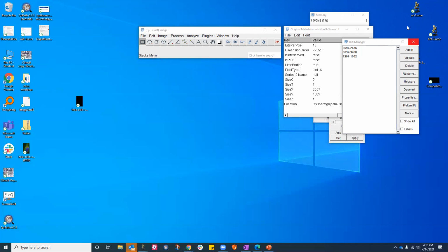And then can I schedule another time with you to do actual measurements of data? Absolutely, but again, it will be very helpful if you have your own data, so that you will feel much more personal about it. Right, that's what I'm more, yeah, happy. Yeah, I'll be much more happy to do some of that with my data sets. But again, you will feel much more involved if there is a data set which is coming from the question that you are trying to ask. Right. Okay, so let's aim for getting some data from your side, and then we can continue this. Okay, sounds good.